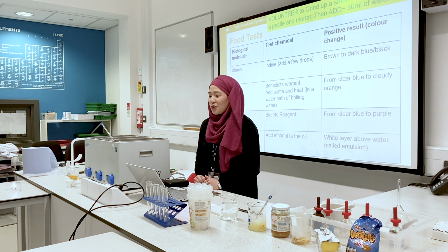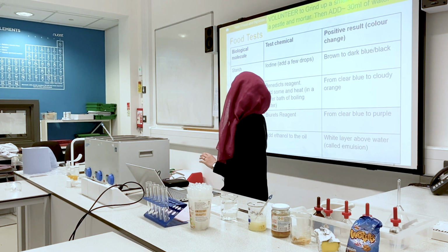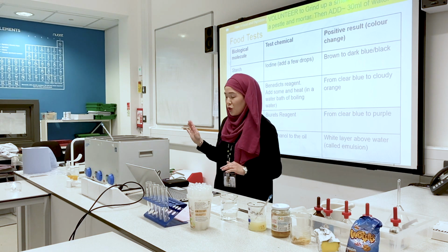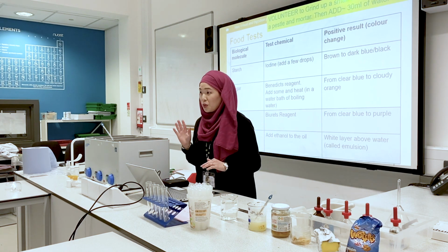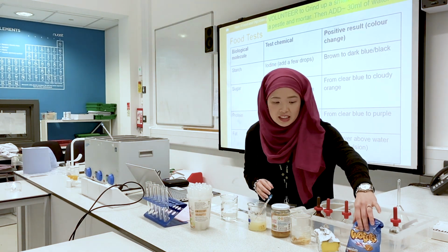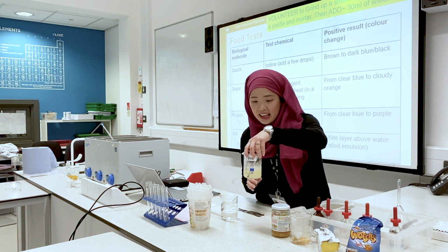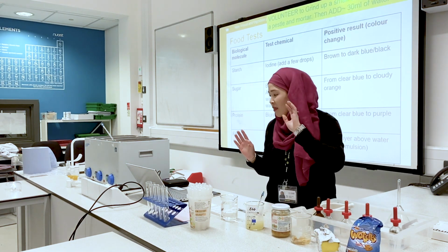Today I'm going to do food tests with you. I will run through the chemicals that we will be using as well as what result you would expect. The foods that I will be testing today are Wotsits, butter, pasta, honey and egg that has been pre-cracked.